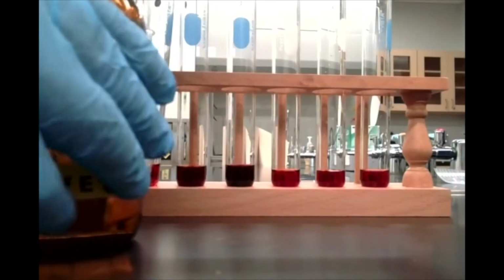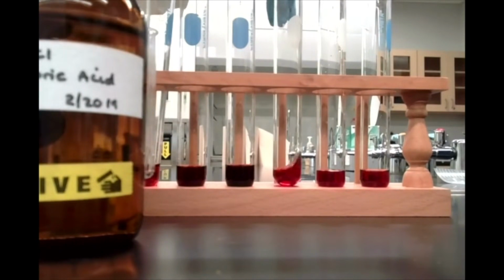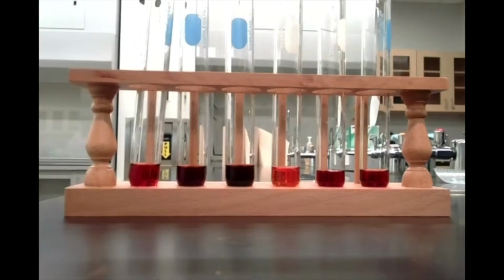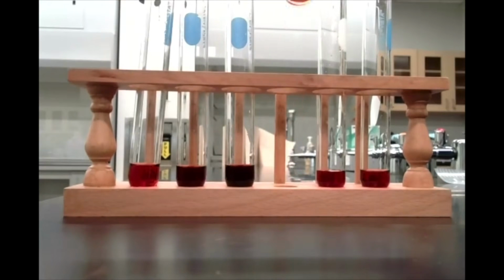So we're going to go ahead and add this to test tube number 4. That's this test tube over here. So I'll go ahead and shake that up just to make sure that everything's well mixed.